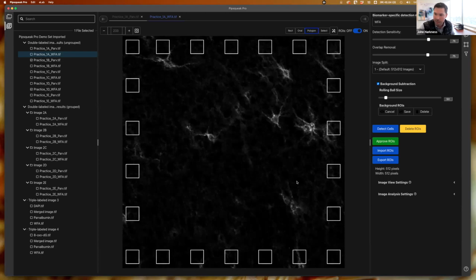And here I can see these square ROIs around the perimeter of my image. And what these ROIs are doing are actually measuring the pixel intensities all around the perimeter. It's taking an average, it's creating a distribution of these pixel intensities. And what we're selecting is actually the middle 2/3 of our distribution and calling that our background. And the reason for that is we obviously don't want to subtract out signal from our background, but we also don't want to subtract out areas of the image that are lacking tissue.